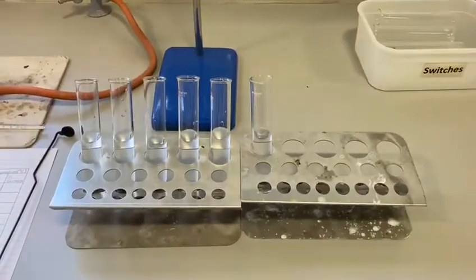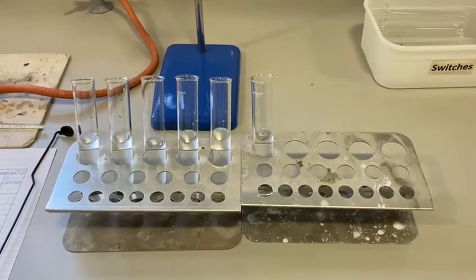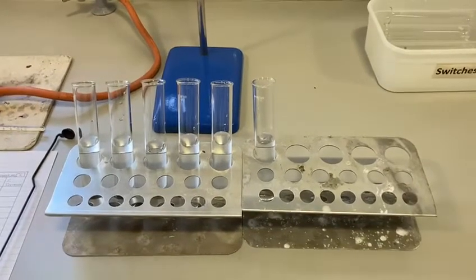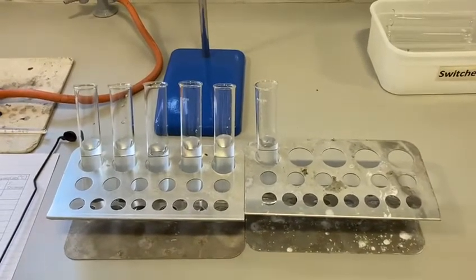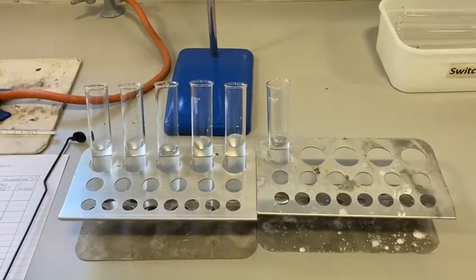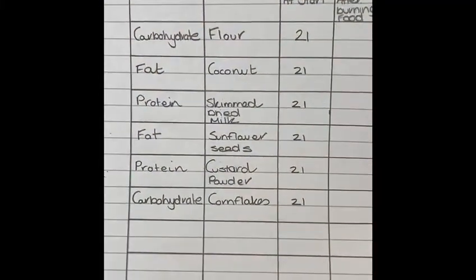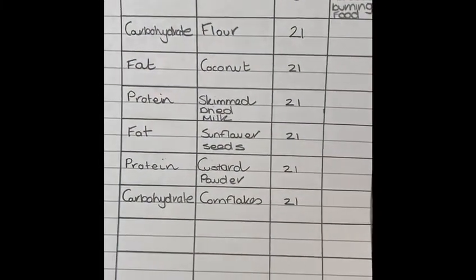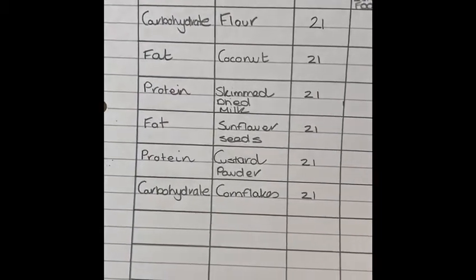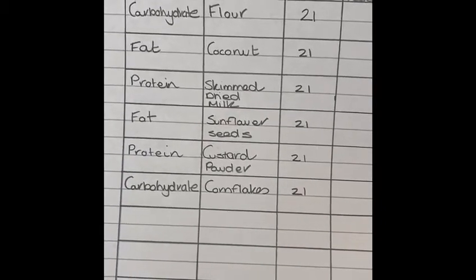Using a measuring cylinder, the same volume of water has been measured out equally for each of the boiling tubes. 30 millilitres of water has been added to each of the 6 boiling tubes. Having measured the water, I'm now going to take an initial temperature reading of each of the boiling tubes before starting to burn food. Before carrying out today's investigation, it would be worth having your results table pre-prepared. This will allow you to take a note of the temperature change during each of the experiments today.